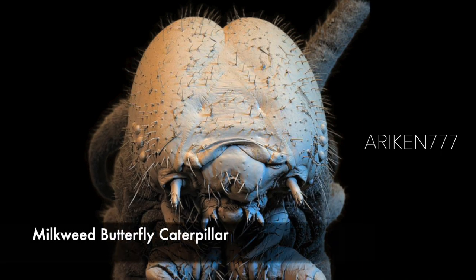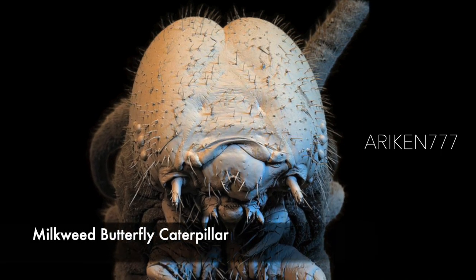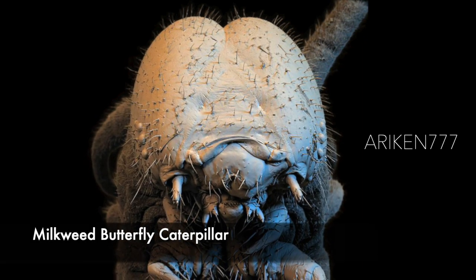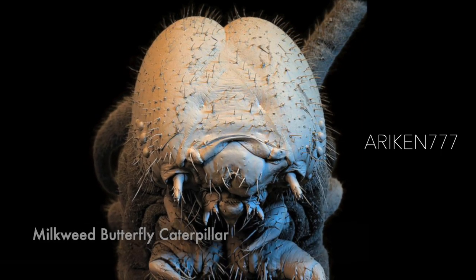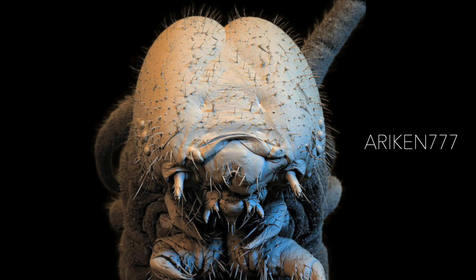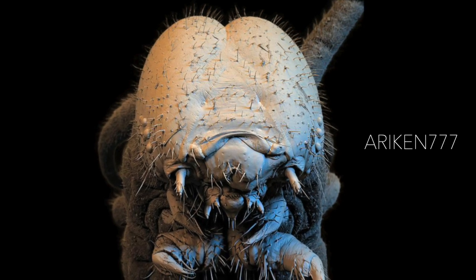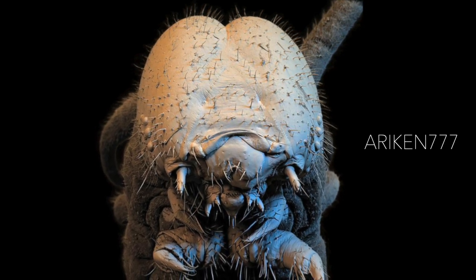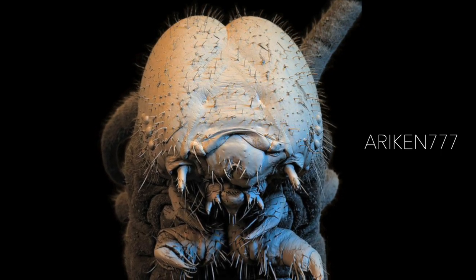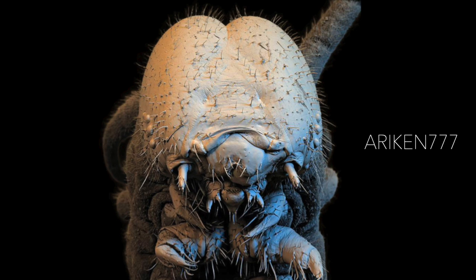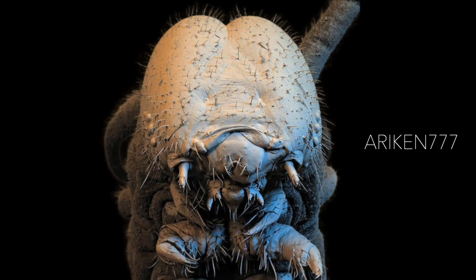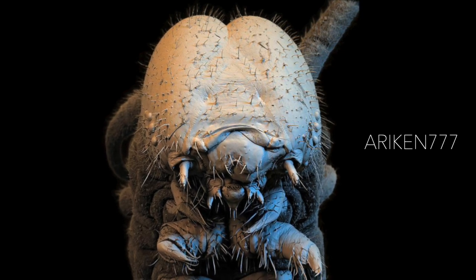A milkweed butterfly caterpillar. This image shows the underside of the larvae of a milkweed butterfly, showing its mouth parts in lower center and forelegs at bottom center.